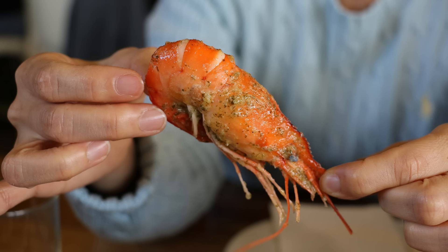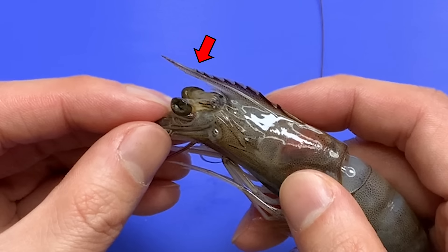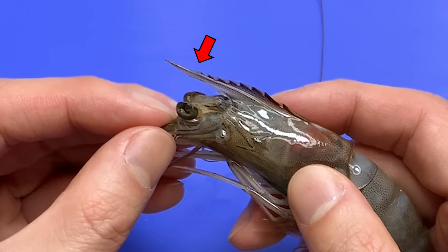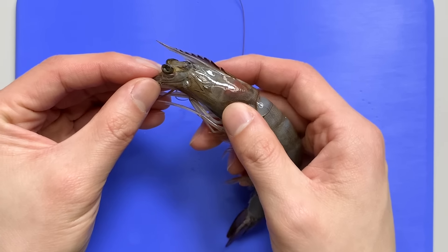Especially, insects and crustaceans have many similarities. To be honest, if you look closely, shrimp are as gross as insects. But why do people hate insects and like shrimp? In this video, let's take a very close look at the shrimp.